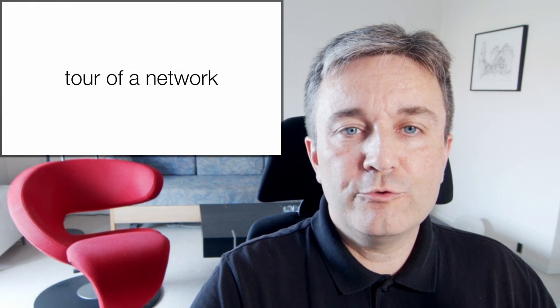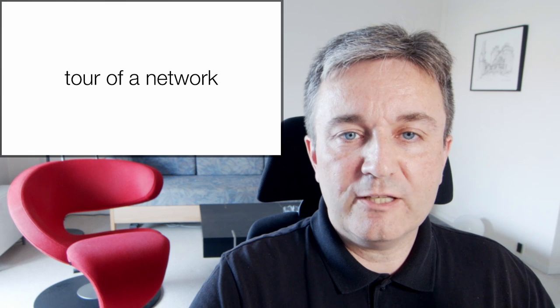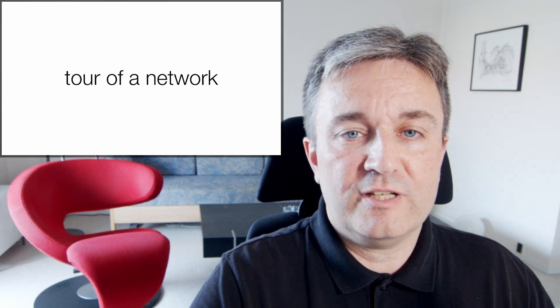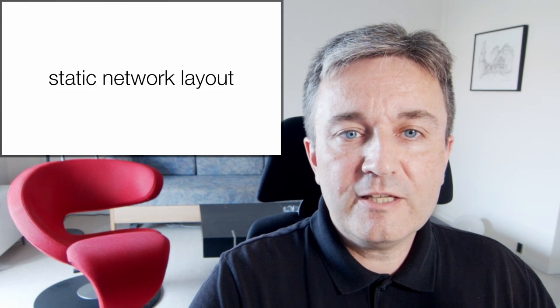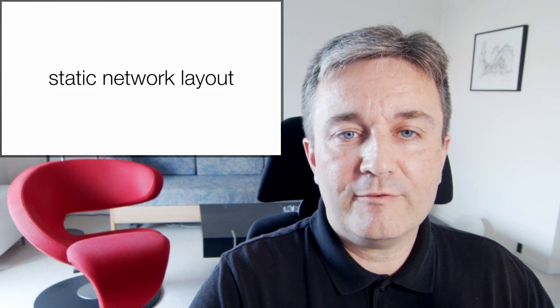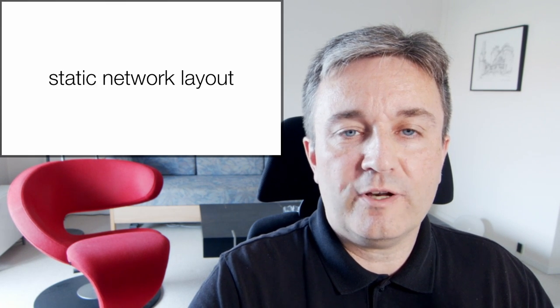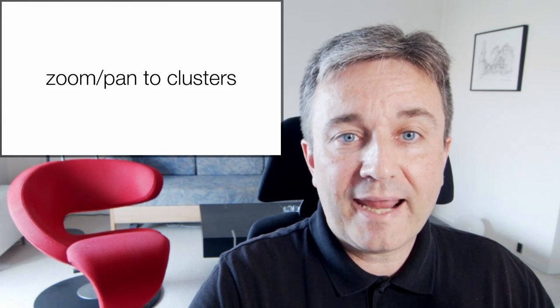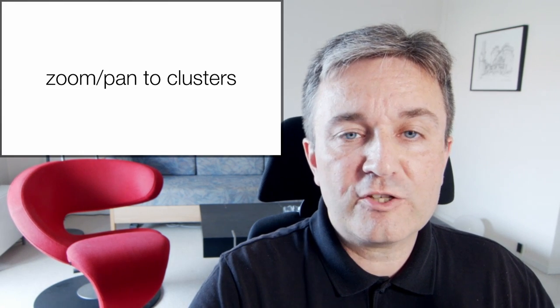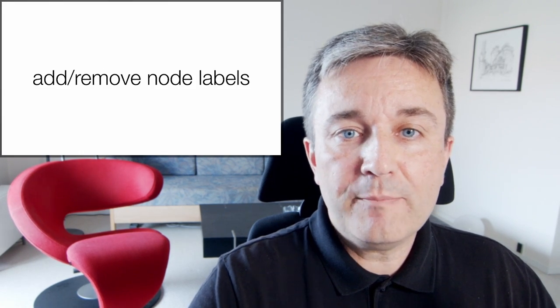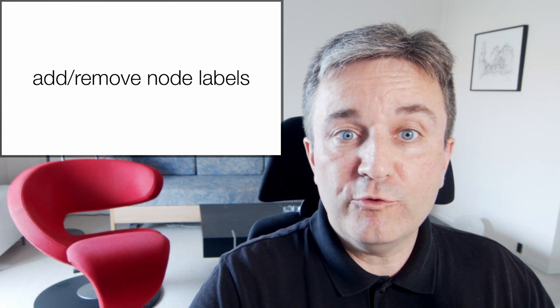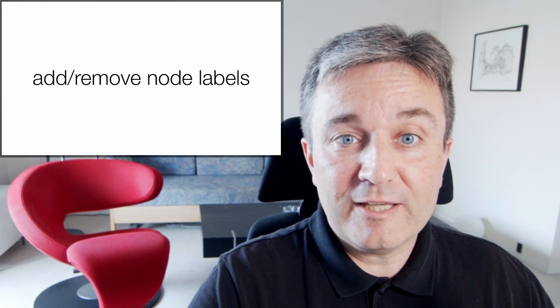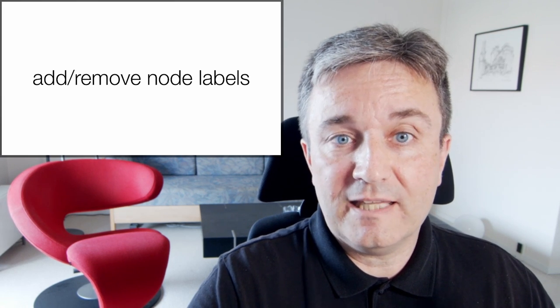Finally, you might want to use animation to make a tour of a large network. In this case, you might have a static network layout and start with a global view of it, then zoom and pan to different clusters, and maybe add and remove node labels as you're zooming in and they become readable.